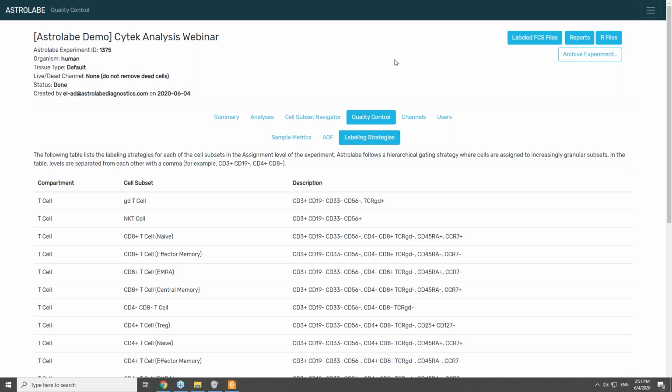Great, thank you, Elad. Beth, I'd like to jump back to GemStone and cover a question that we didn't get to between yours and Elad's presentation. It is, where do you perform all the cleaning and pre-processing, for example, the compensation, scatter gating, viability, etc.? Where does that processing occur?